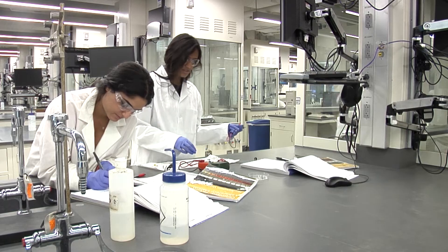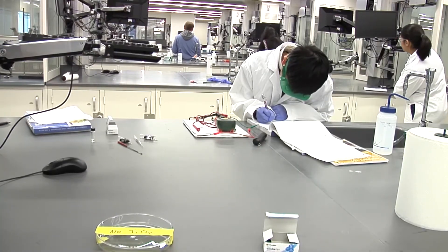All fascinating ideas for the freshman chemists. This process is so cutting edge. All these procedures are so new, and it's great to be a part of this learning process where we're seeing how efficient we can make this.